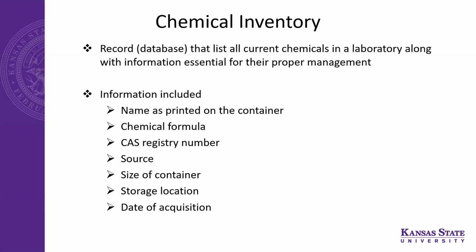So in our department, all the PIs and the teaching labs do their inventory, and as the safety officer, I have all those inventories. For some professors, if they start a new project, they may need a new chemical which they don't have in their lab. So they always come to me and ask me to check whether the chemical is in other labs in the department. This is associated with the hazards of chemicals, right? If you want to try something new, you can always borrow a little bit of chemical if it's available in the department or on campus.